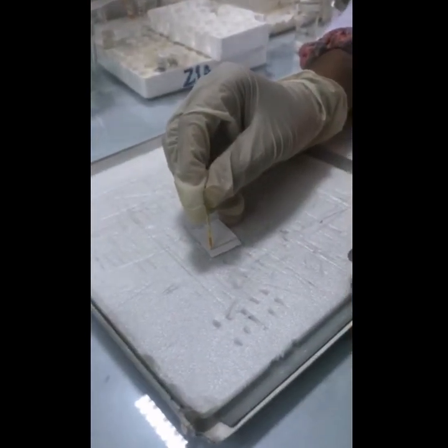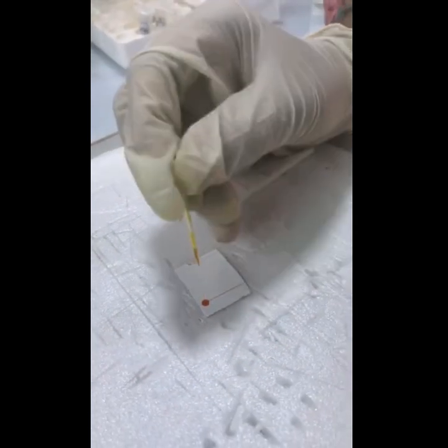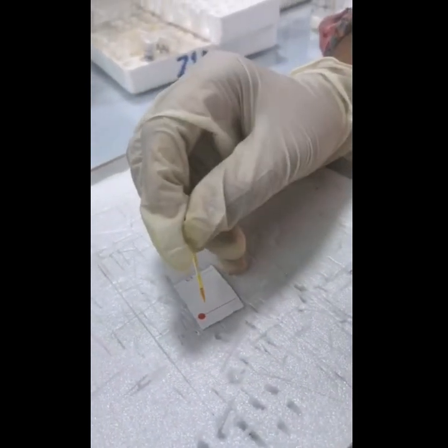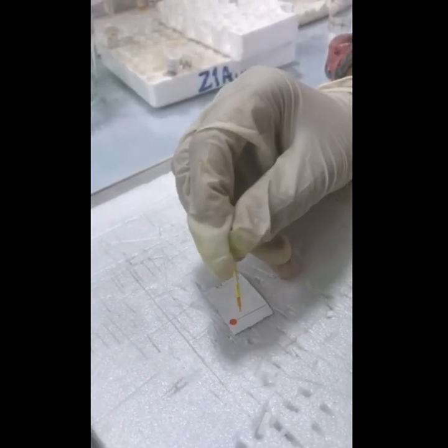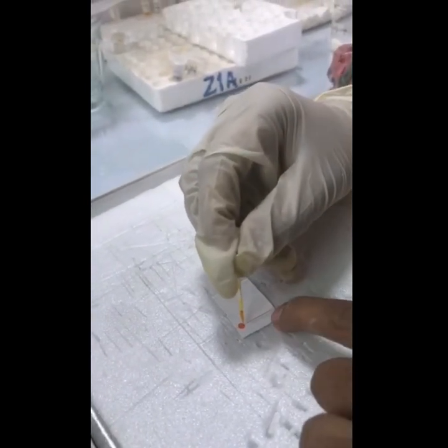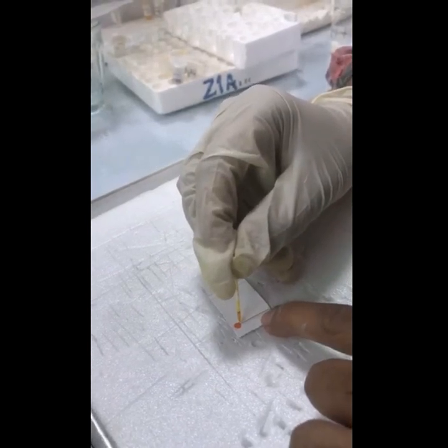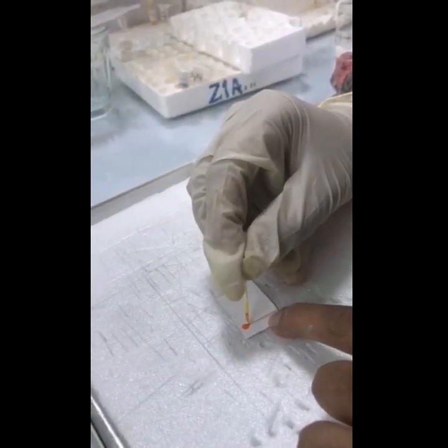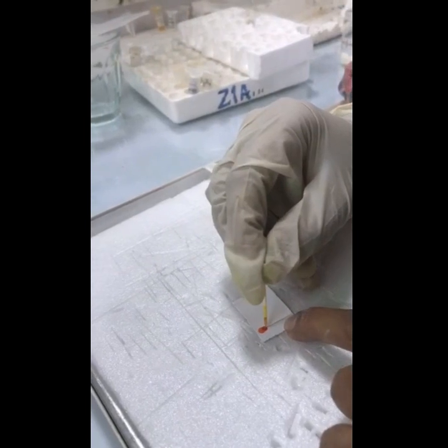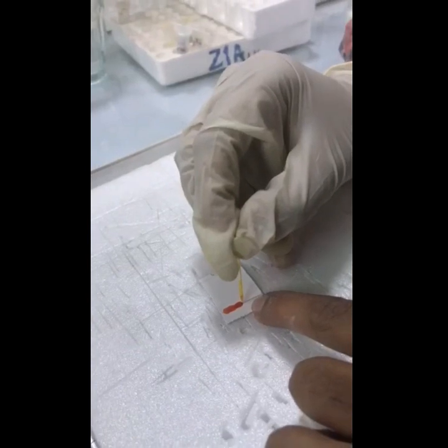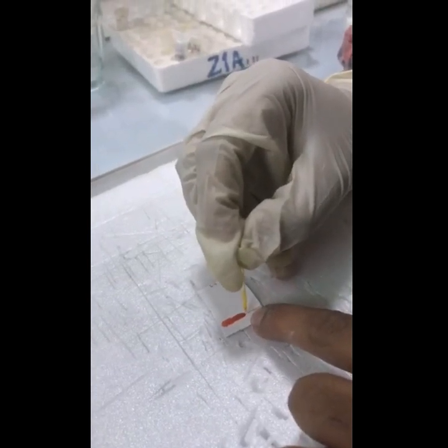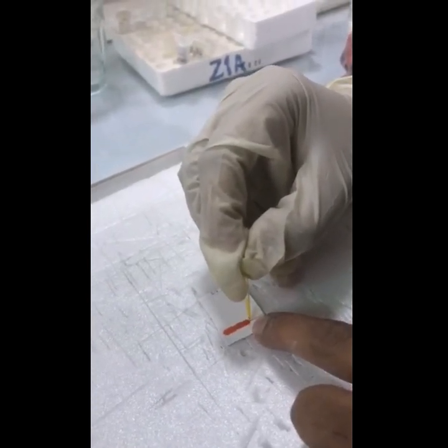Then I loaded the solution that I prepared on a TLC plate on its baseline. First, I loaded all the sample on the TLC baseline. When it dried, I again loaded the sample on it, and in this way all my sample was loaded on the TLC plate.